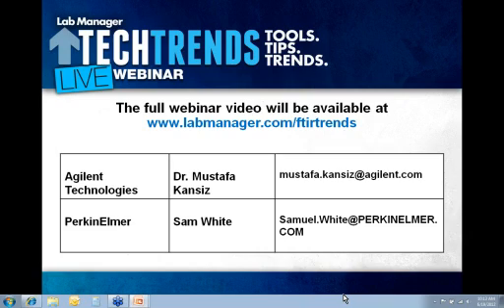Sam, I don't have any direct experience, though I'm aware of a colleague, I believe in Canada, who was telling me that the ability to actually measure these directly on the filter itself, with or without digestion, is possible. I'm not too sure if that particular person would be interested in sending me an email. I could put them in contact with somebody who could provide more info.